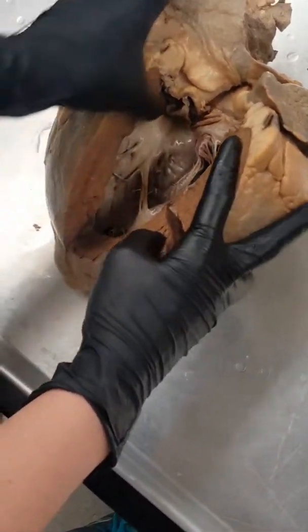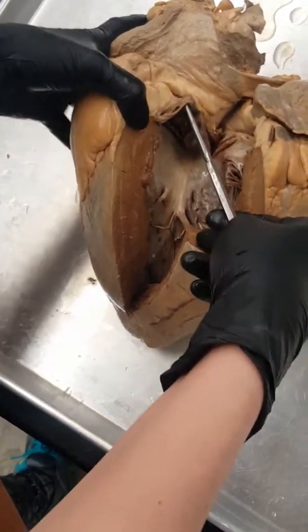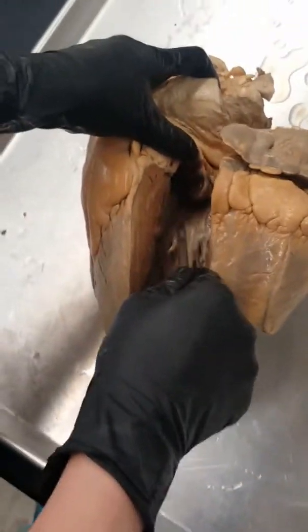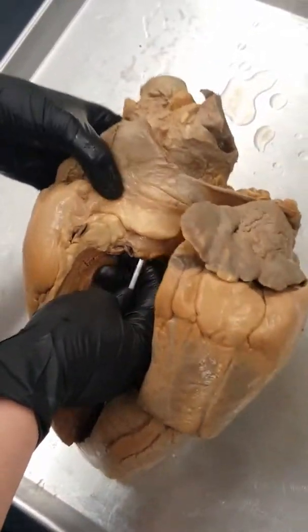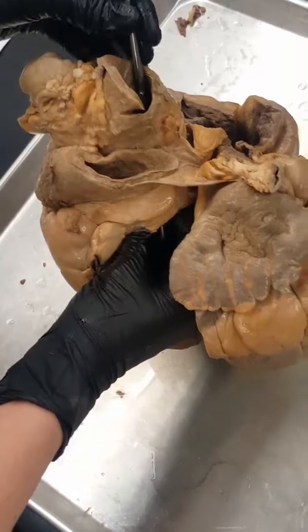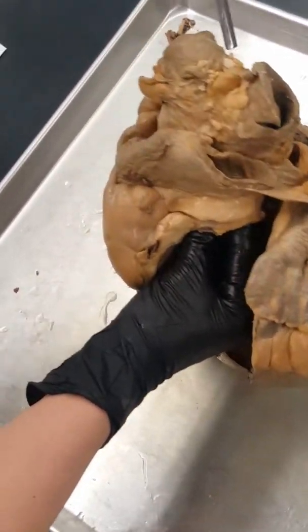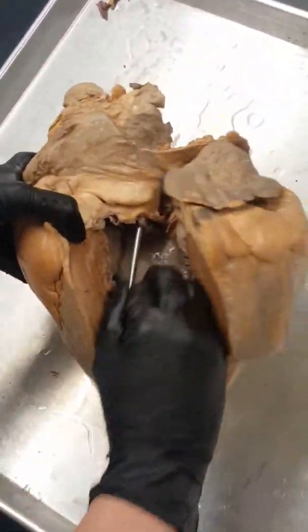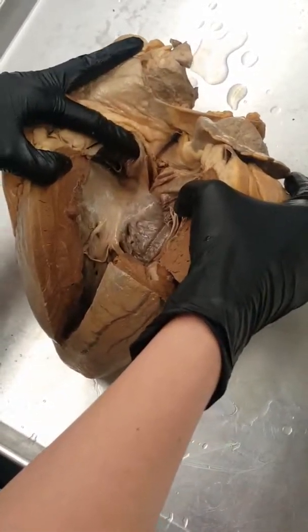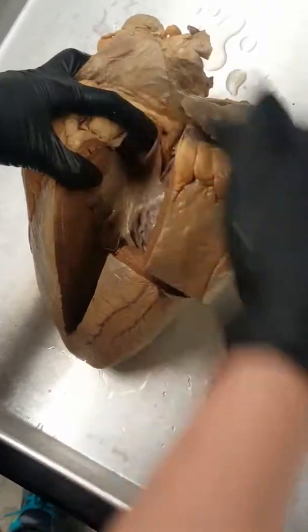Now if we open up our heart — remember we're on the front view right now — once we open up you can kind of see all these little strings in here. These strings are going to be the chordae tendineae. You can see this muscle where they're attaching — that muscle is going to be the papillary muscle, and it meets up with the chordae tendineae where it attaches.